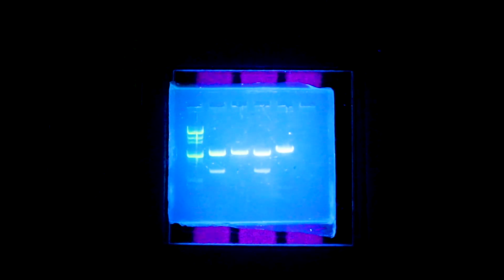Lane 2 is the one that is our crime scene, right? So that tells us this was the DNA that we found at the crime scene, which means that's the one I'm going to compare to lanes 3, 4, and 5. And so your job is to look at lane 2, our crime scene, and compare it to lanes 3, 4, and 5, our 3 suspects, and figure out which of those 3 suspects you think committed the crime based on their DNA pattern there in the DNA bands.